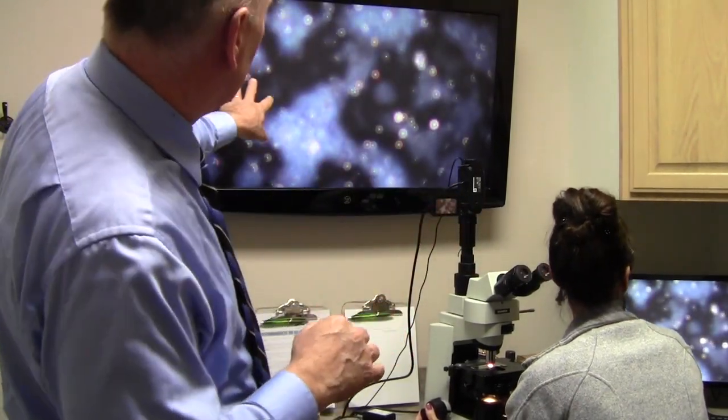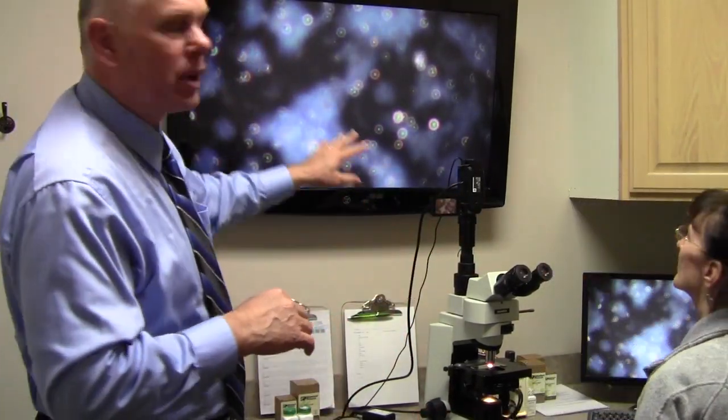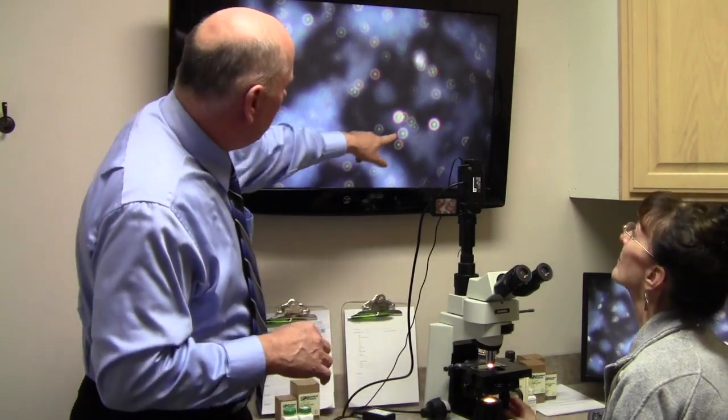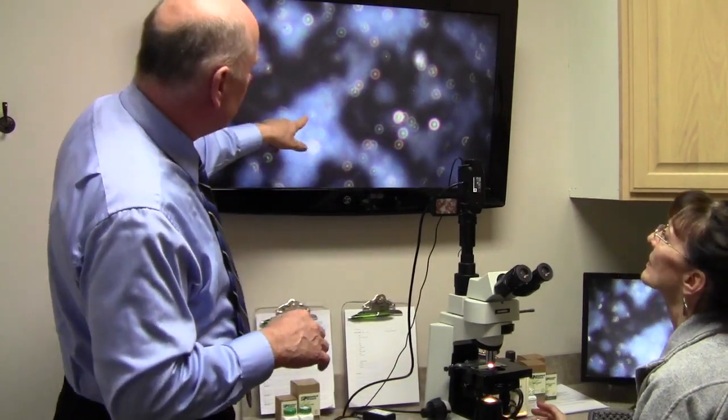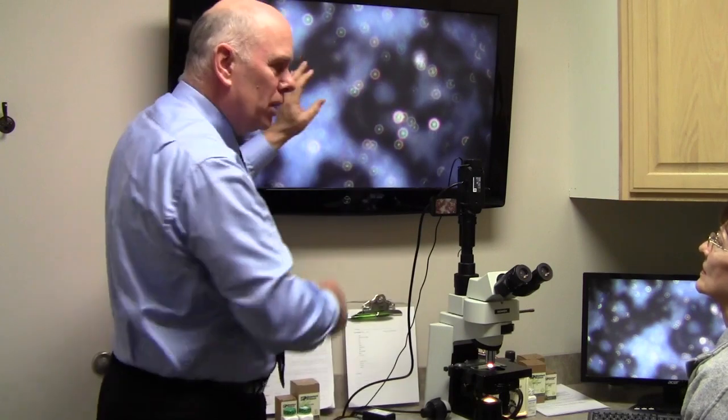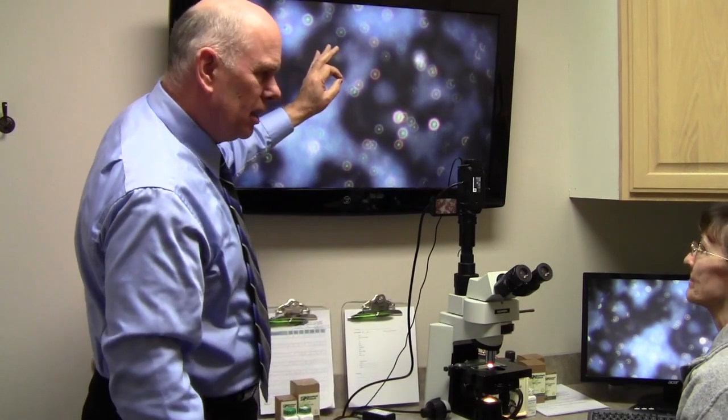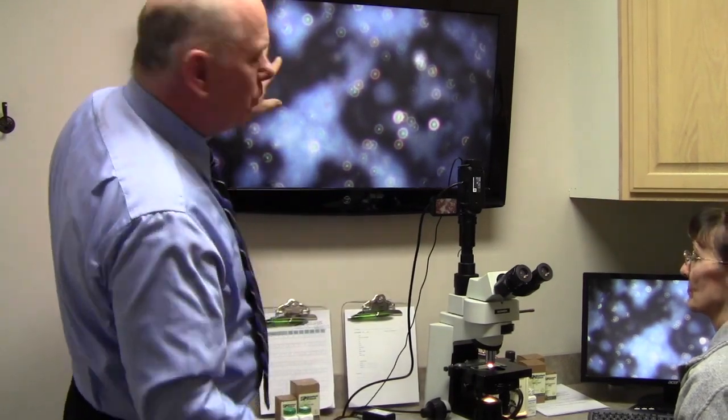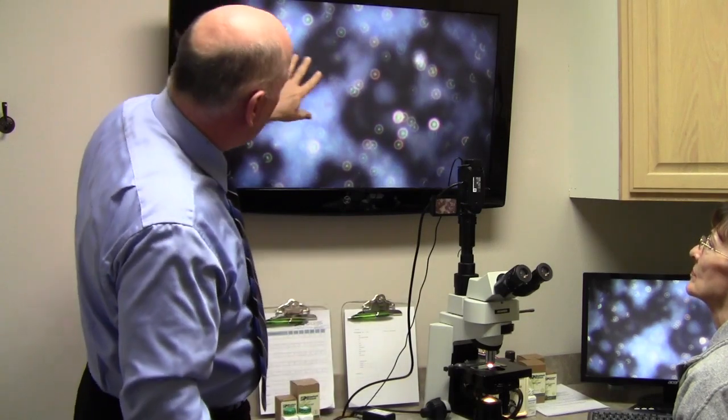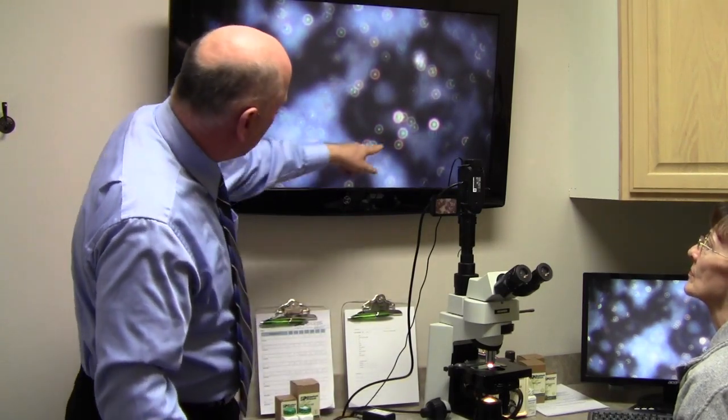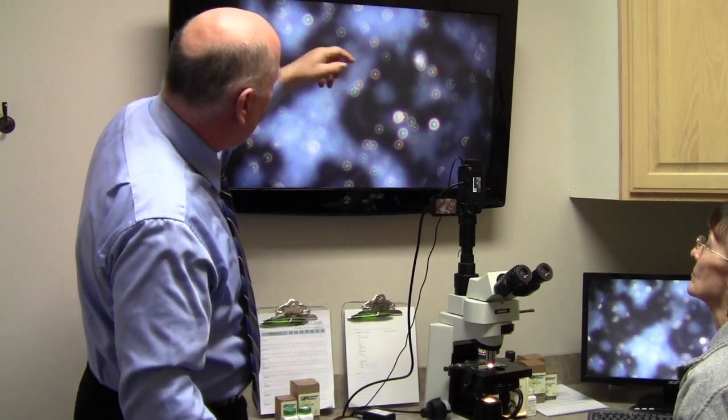And so we're looking at our titanium dioxide up here on the screen from the microscope here, and so each one of these dots is, this whole screen is about the size of the head of a pin. About the head of a pin, and when we put this on a light bulb, you can see all the little circles, all the little dots here of titanium dioxide.